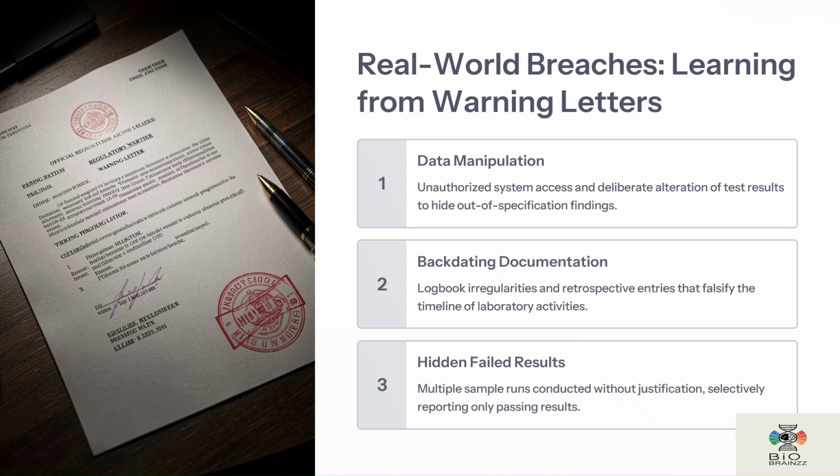A third issue is hidden failure results. Sometimes analysts repeat tests multiple times and report only passing results while ignoring failed data. This practice is often called selective reporting or testing into compliance. Such actions destroy trust in laboratory data and can result in serious regulatory action. These examples remind us that integrity is not just about systems, it is about ethical behavior and scientific honesty.